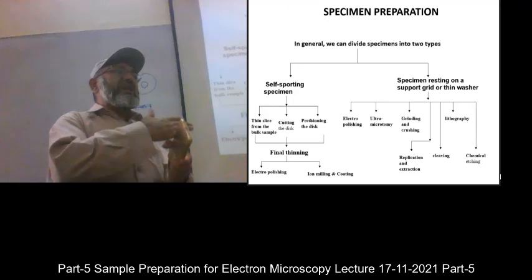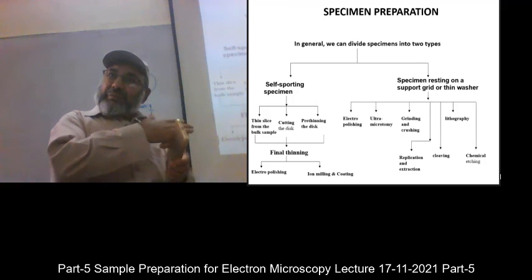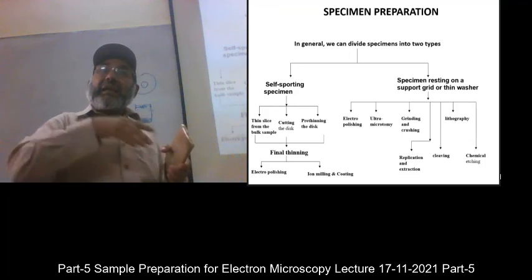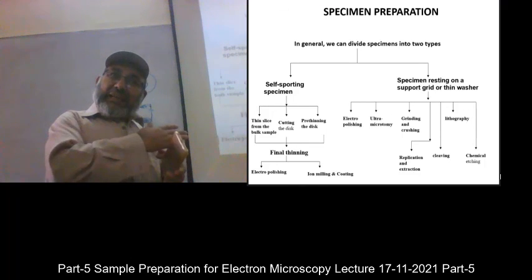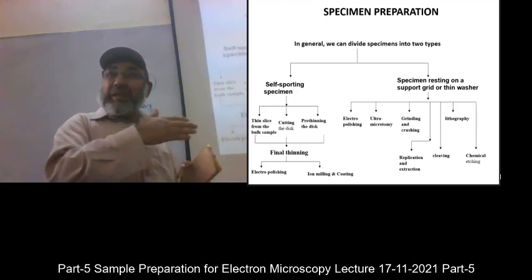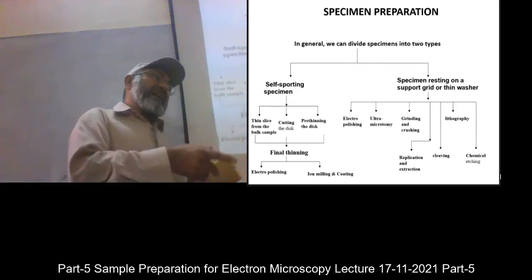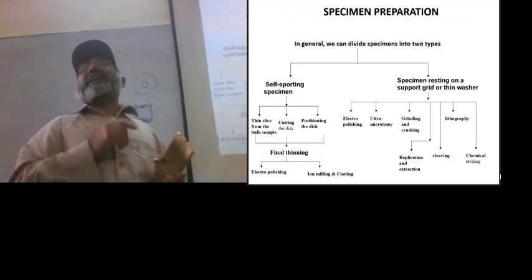But if I use a chemical which is dissolving the material as the salt is passed on it, then instead of mechanical pressure, the cutting occurs because of the chemical, and that is a soft way of cutting. So when you soften the cutting or polishing or grinding, what happens? The material is not damaged.